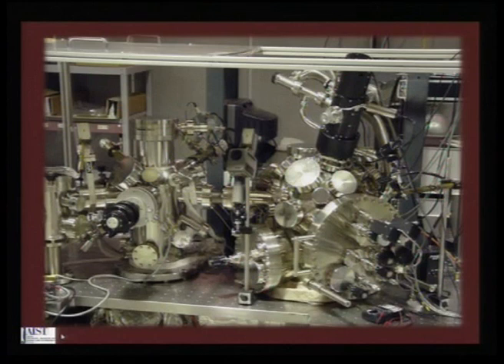So, although the machine looks very simple, in reality it is a painstaking effort, because this is an ultra high vacuum chamber which is actually having the STM features. So, to get an STM image, it is a very costly probe. Nowadays, different forms of scanning probes are coming, where you can even use a scanning probe in an ambient condition, in a laboratory and in a clean room atmosphere. But STM essentially calls for a high vacuum environment. Therefore, it is called UHV STM, that is ultra high vacuum STM.